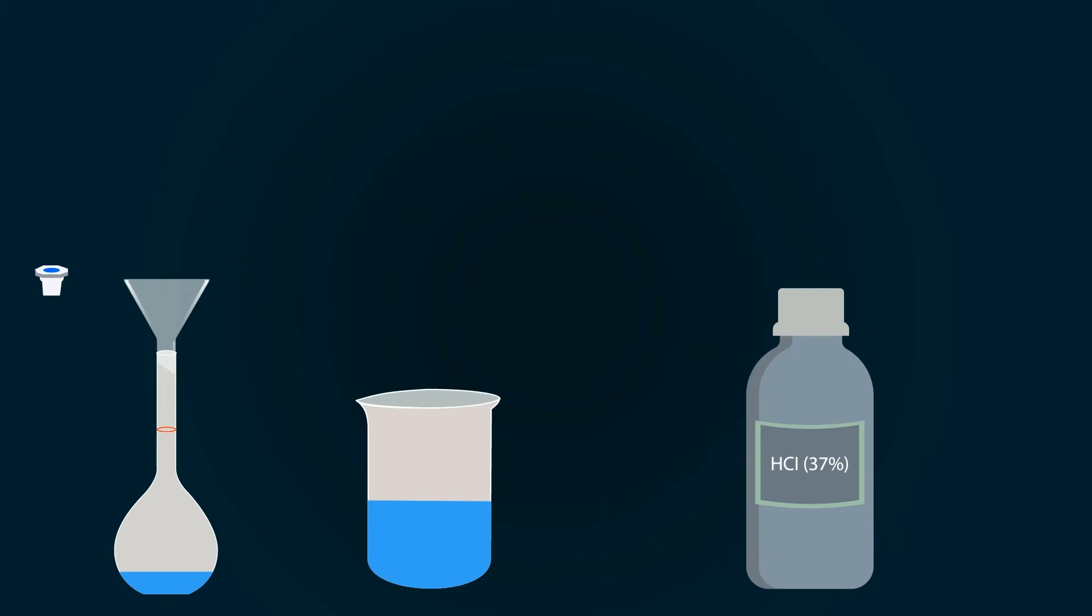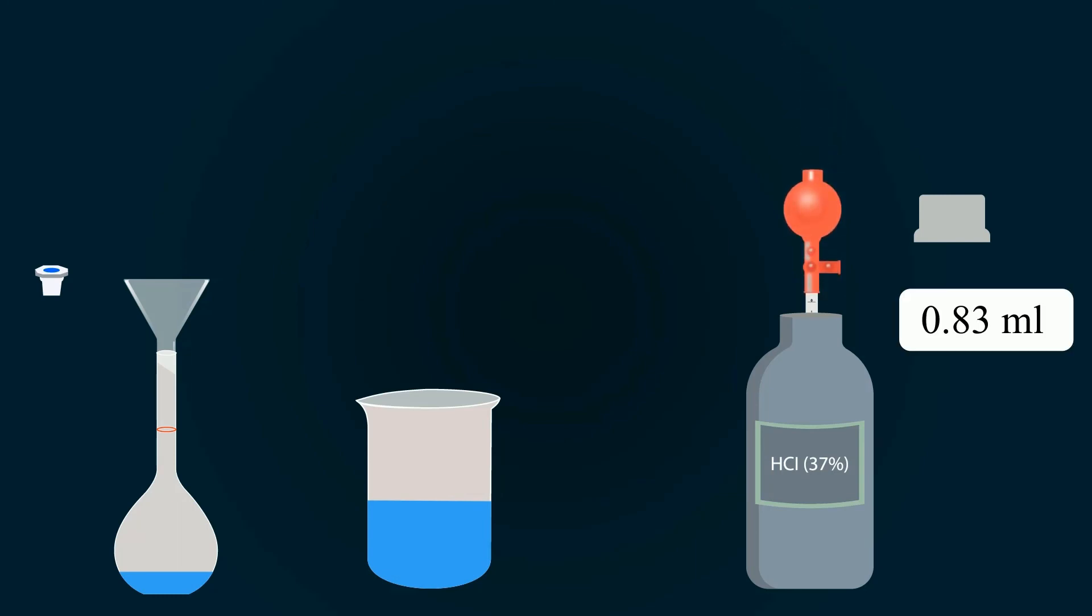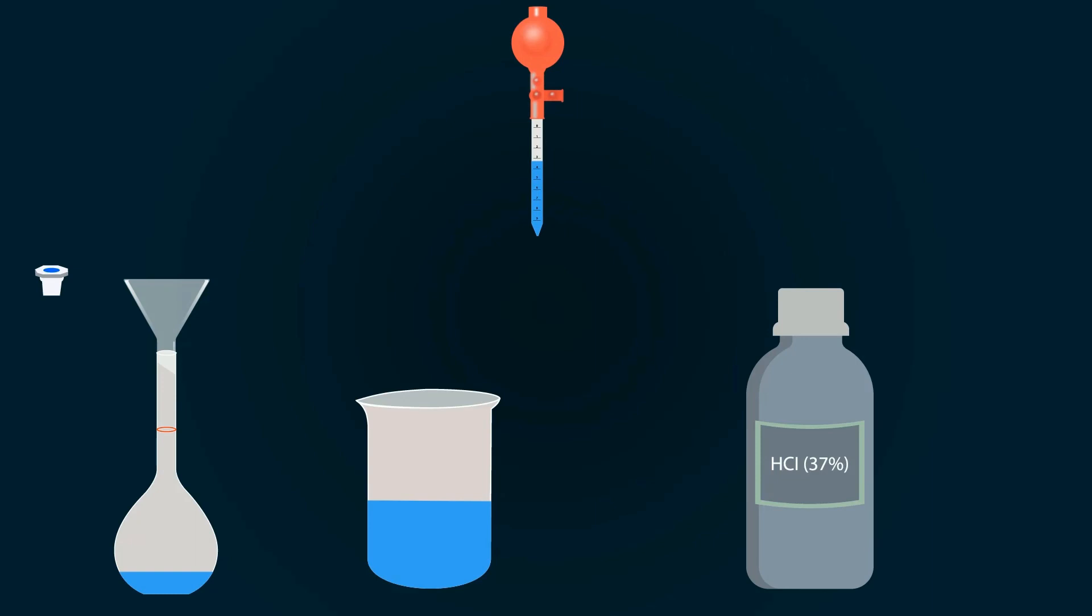Now take 37% HCl. Pipette out our required volume, which is 0.83 milliliters, and add this into the volumetric flask.